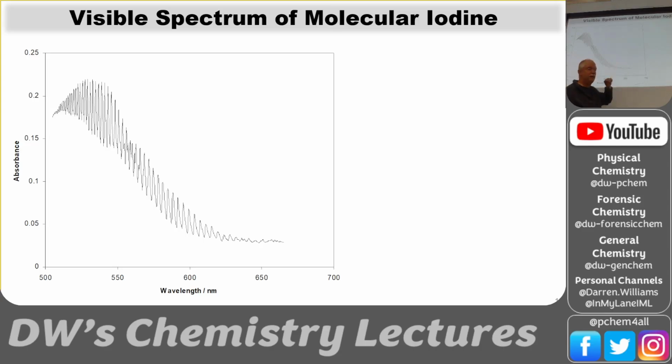And we used to get these on chart paper. It would just come out on chart paper, and you'd use your ruler to measure. If you had something in between the little blocks on the chart paper, you would interpolate and find out what wavelength you were at. We had this long 8-foot table, and everybody working on different parts of it. Our spectrum would be like 8 to 10 feet long. So I love the digital age.